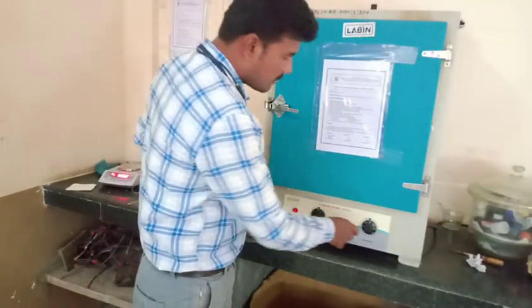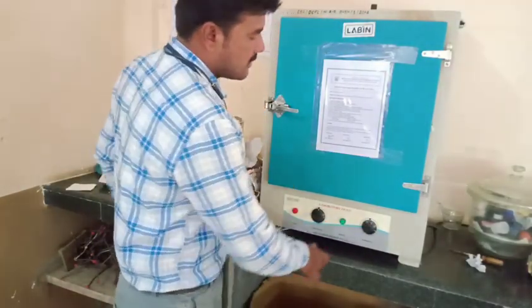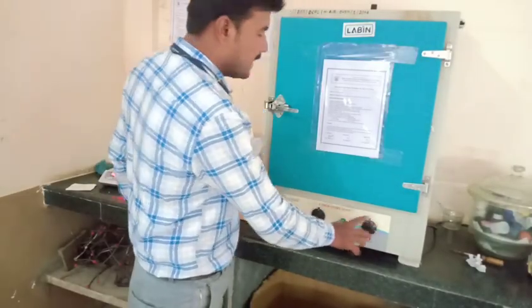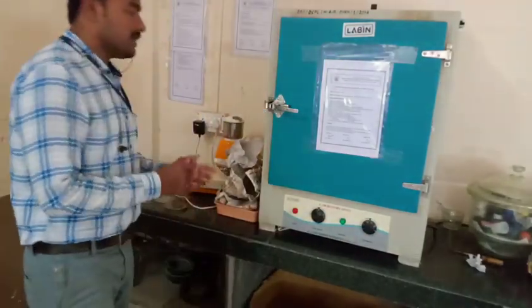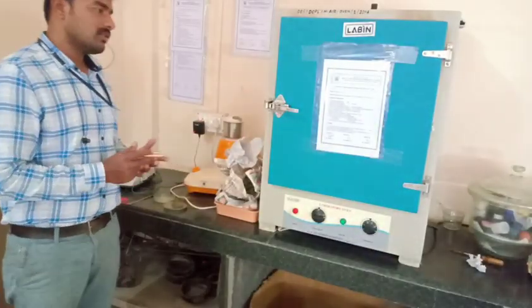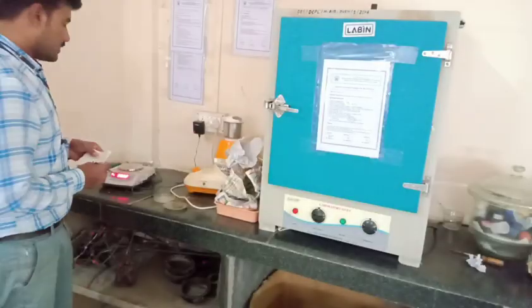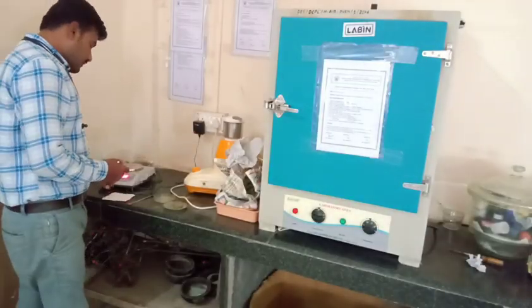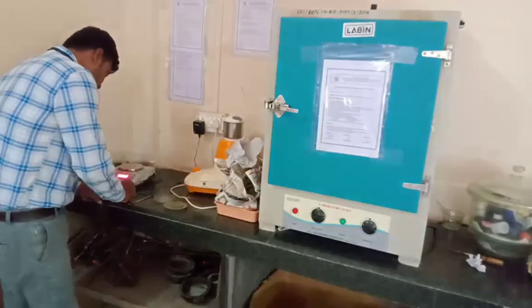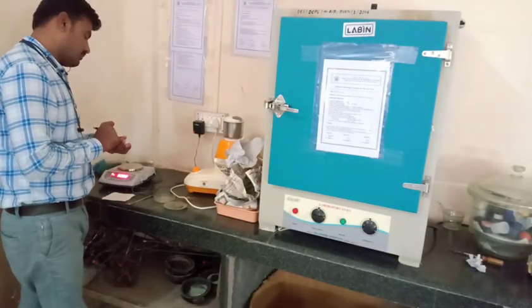The temperature of the oven is maintained above 100 degrees Celsius, that is 110 degrees Celsius, and kept for 3 hours until complete evaporation of water is done. After 3 hours you have to weigh the petri dish with the crude drug, and whatever weight comes you have to note down.